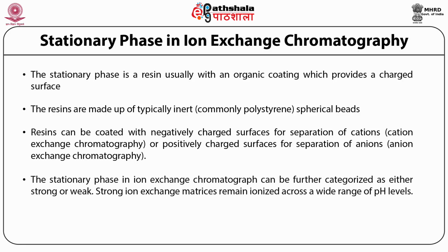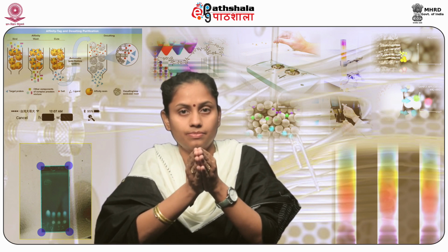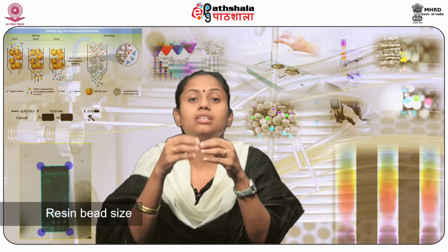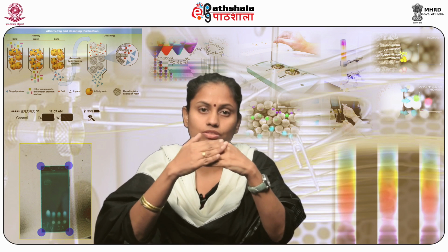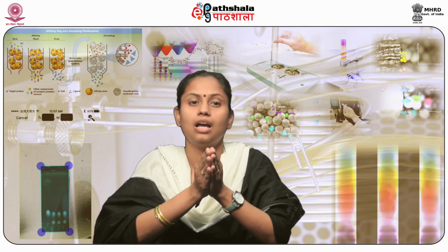The stationary phase in ion exchange chromatograph can be further categorized as either strong or weak. Strong ion exchange matrices remain ionized across a very wide range of pH levels. Now, the various properties of the stationary phase that affect the ion exchange chromatography are the surface area of the stationary phase, that is, here we are talking about the resin bead size. As the resin bead size decreases, the surface area per unit volume increases, thereby providing better separations of the compounds. The density of exchange sites on the stationary phase surface also affects the separation or the elution procedure in ion exchange chromatography.